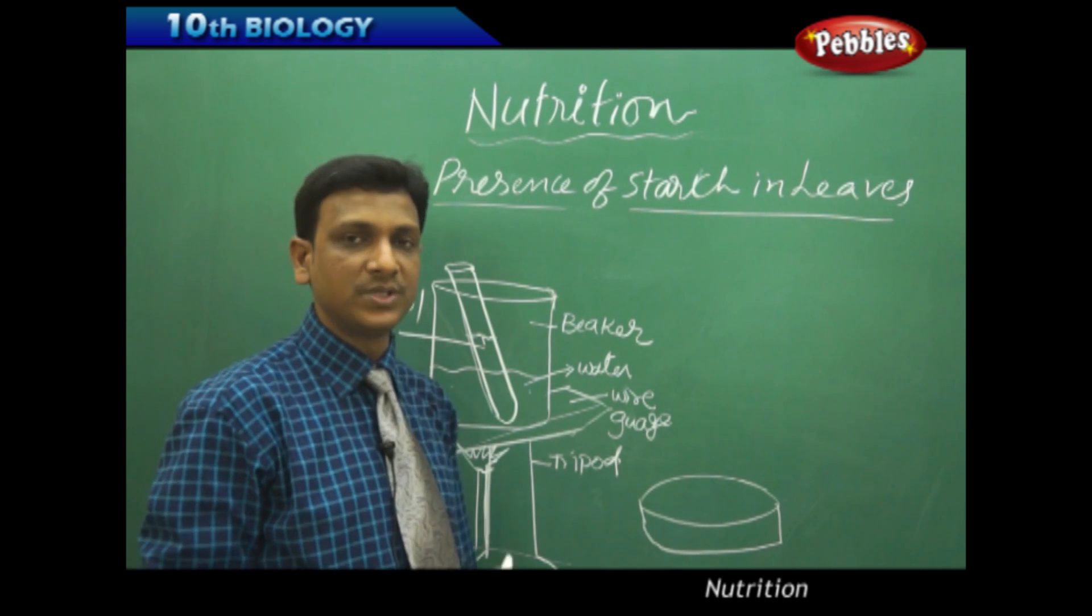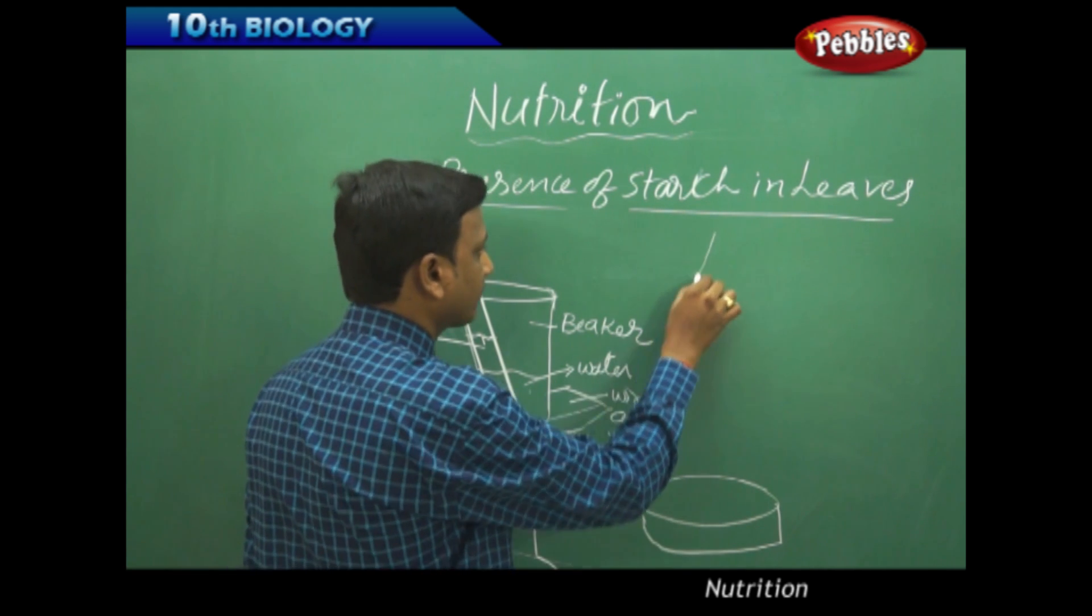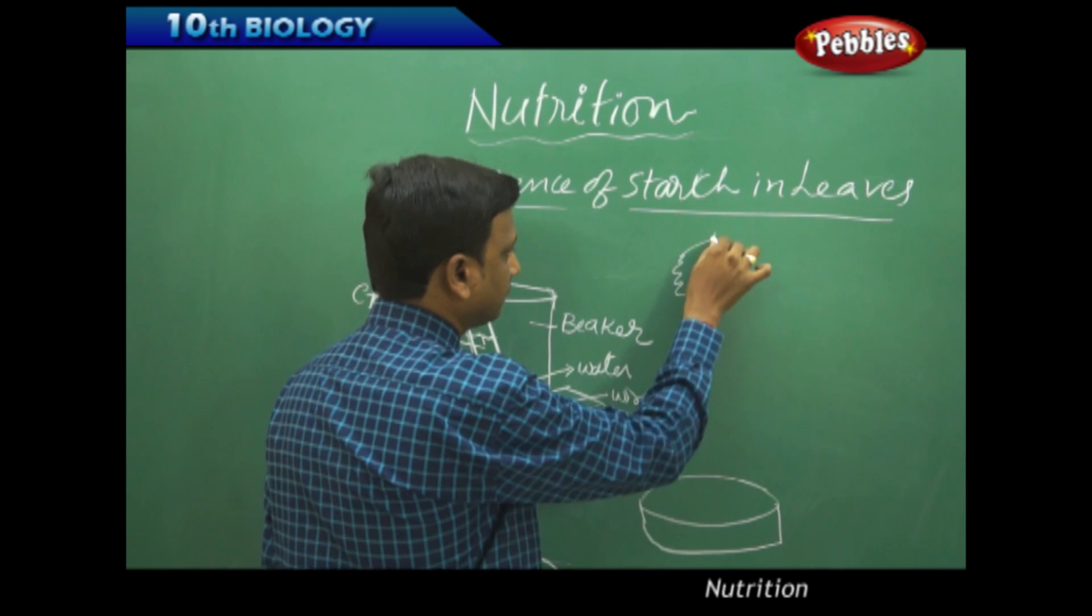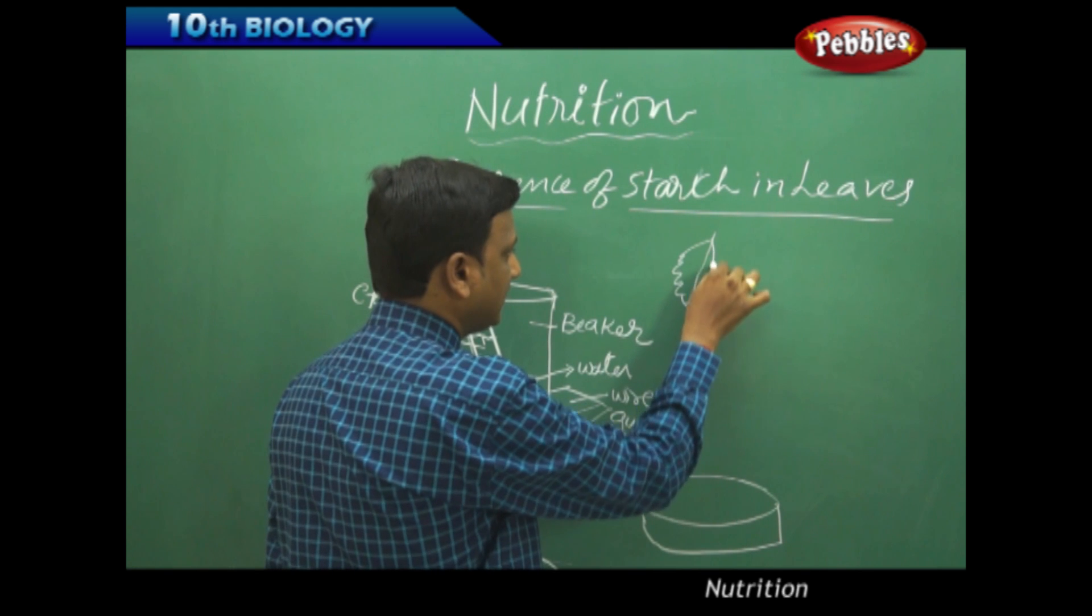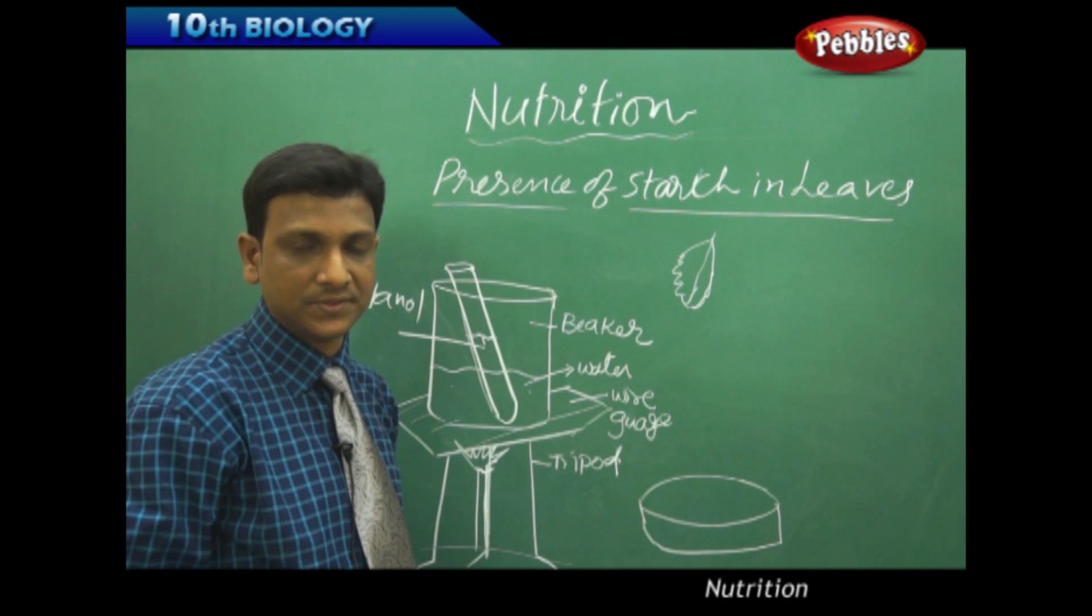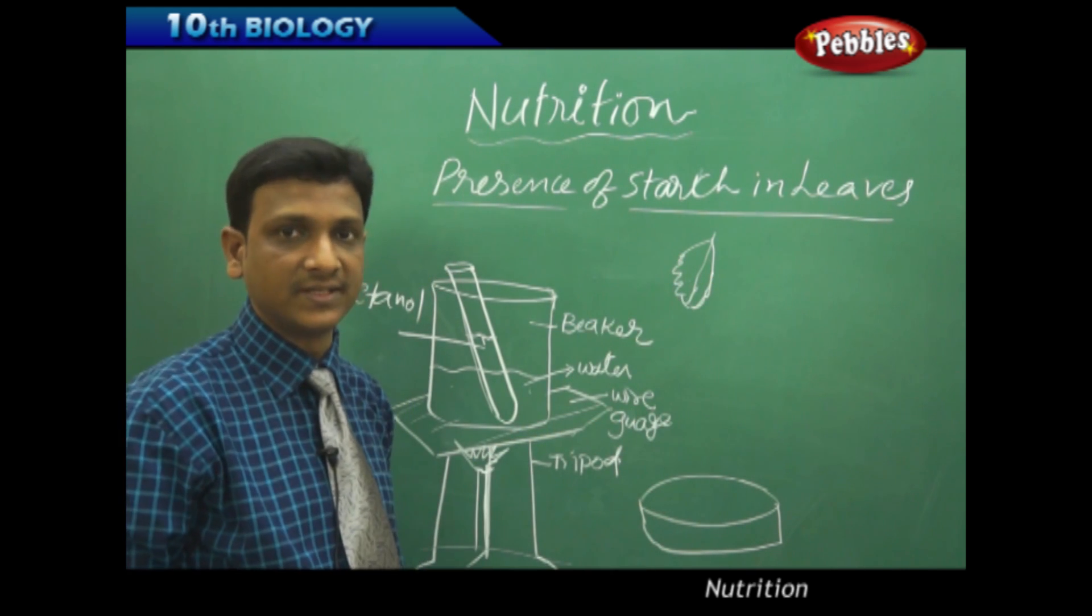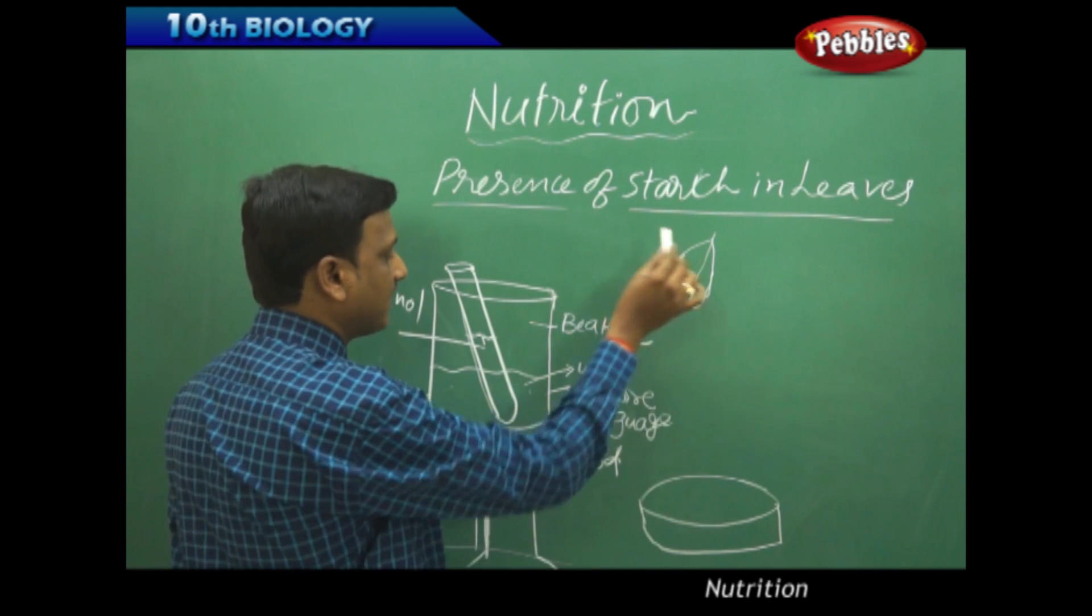Now we need to take a green leaf. This is the leaf which we have taken, a green leaf from a plant, just freshly plucked leaf. We are thinking that it contains starch. We are going to test whether it contains starch or not. So that leaf has to be collected.